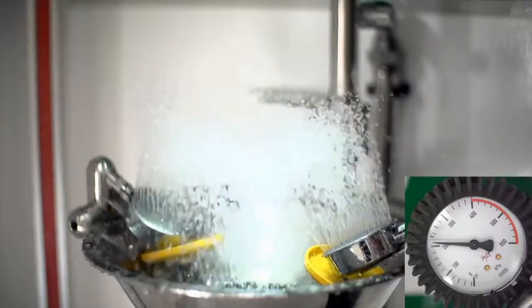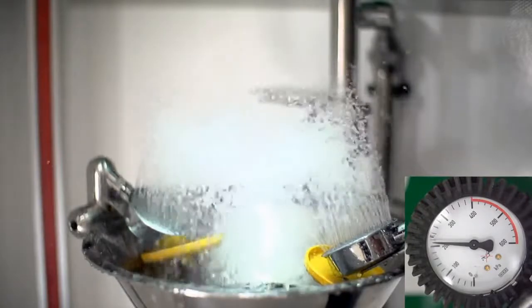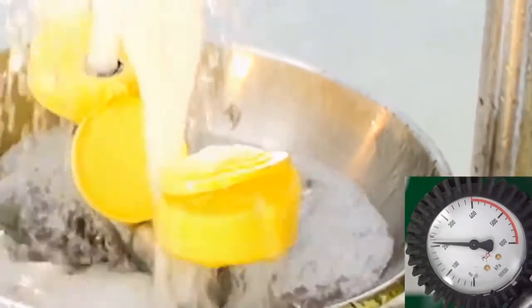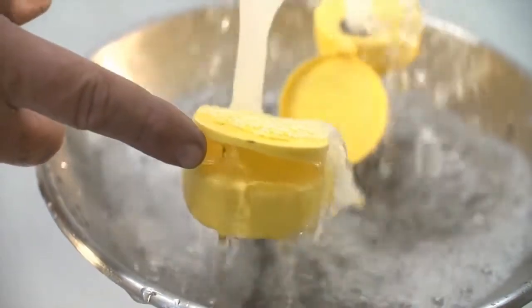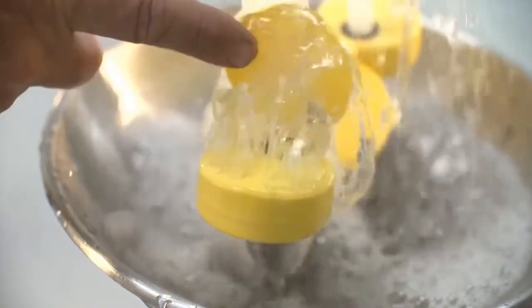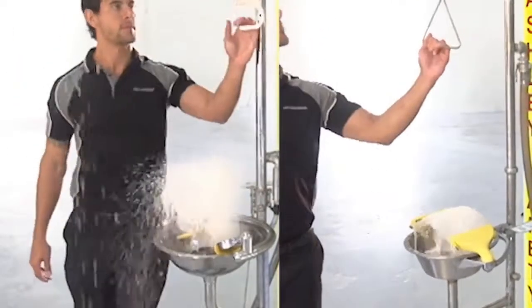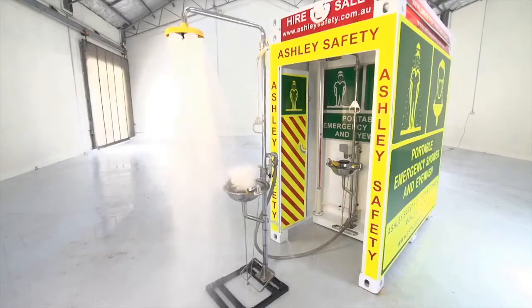Water flow. The water flow is one of the most crucial aspects of the safety eyewash. While others are unable to maintain flow at 210 kilopascals or even push off their own dust covers, Ashley's shower functions perfectly. Many eyewashes struggle to maintain pressure when the overhead shower is activated. Ashley's flow is regulated, ensuring the same consistent pressure at all times, with the eyewash and shower operating simultaneously.